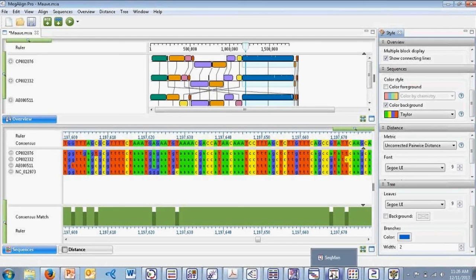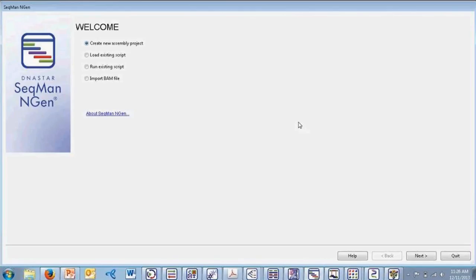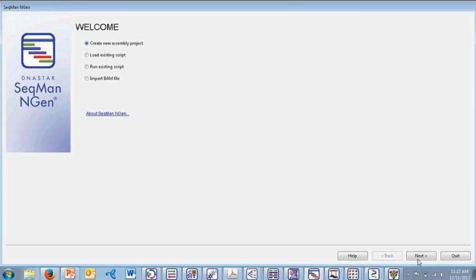Now I'm going to switch gears and start delving into our LaserGene genomics suite. As discussed earlier, this suite supports assembly and analysis of next-gen data. The focal application within this suite is DNA Star's SeekMan NGen, our application for next-gen sequence assembly. This is an extremely easy-to-use interface that allows you to go step-by-step in setting up your assembly. Our assembler was also rated number one for assembling Illumina and 454 data in two peer-reviewed articles accessible on our website.